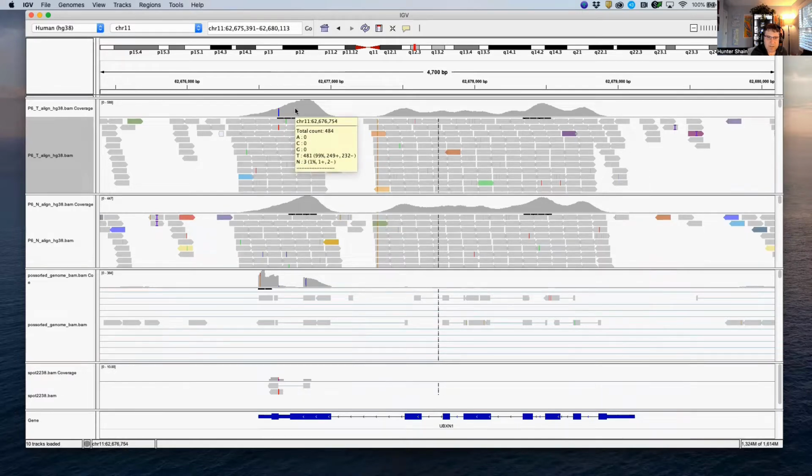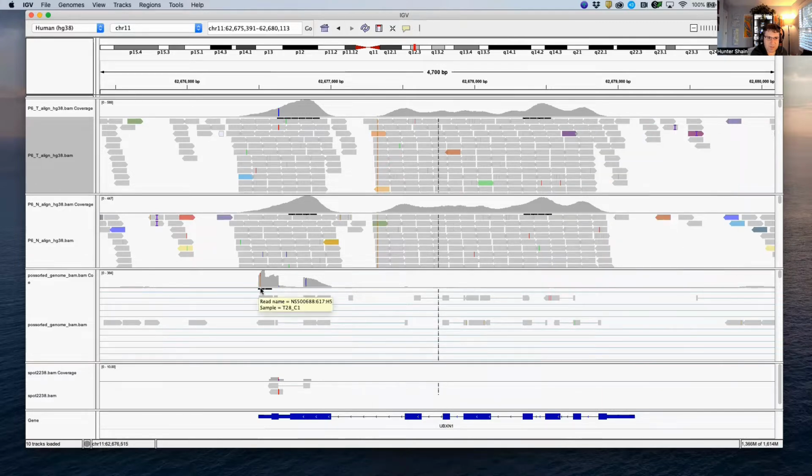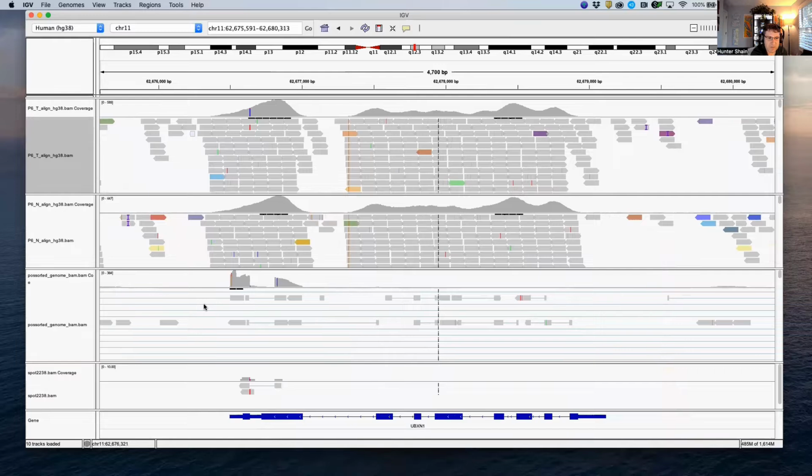The DNA sequencing reads tend to be enriched over the exons, and that's because exome sequencing was performed, whereas the RNA sequencing reads are enriched towards the 3' end, and that has to do with the chemistry that the 10x Visium platform utilizes to perform spatial transcriptomics.